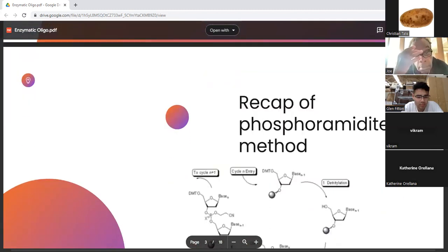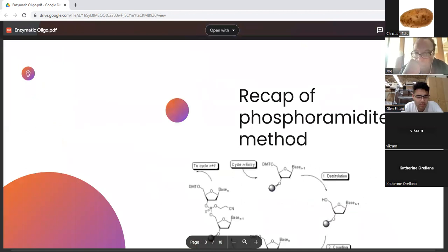So we're going to be talking about the basics of the traditional method of synthesizing oligos, which is known as the phosphoramidite method.